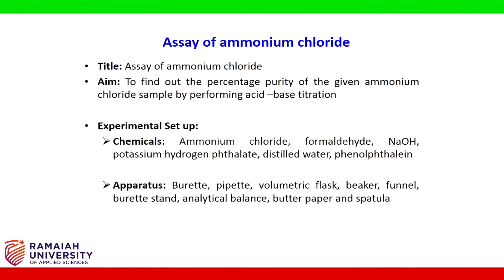Chemicals required are ammonium chloride, formaldehyde, sodium hydroxide, potassium hydrogen phthalate, distilled water, and phenolphthalein. Apparatus required are burette, pipette, volumetric flask, beaker, funnel, burette stand, analytical balance, butter paper, and spatula.